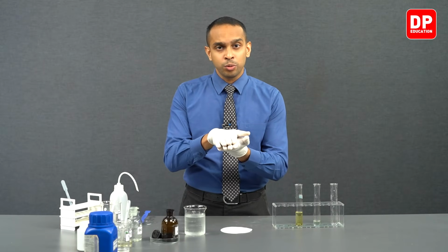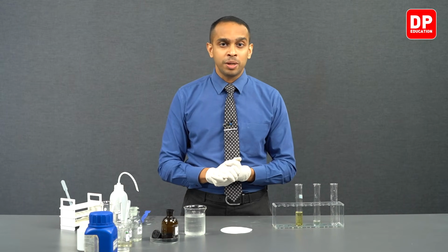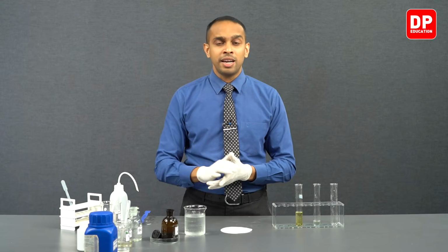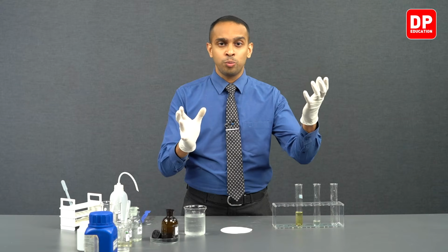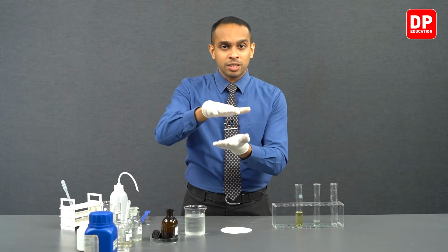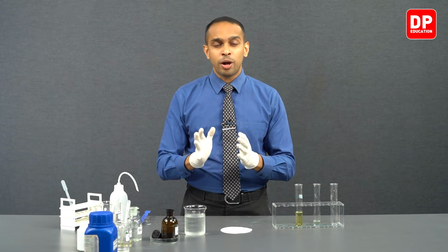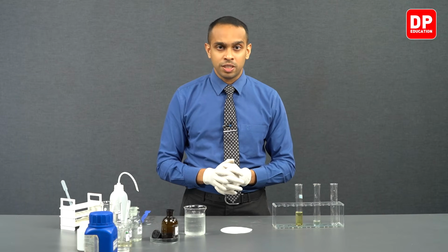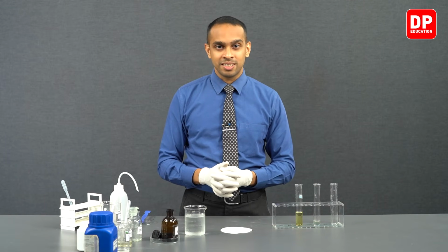At the place where the two layers meet, we saw Fe2+ convert into Fe3+, while nitrate ions turn into nitric oxide. This nitric oxide and the excess Fe2+ present in the medium, along with water, form a complex that is brown in color. That is why we observed a brown layer where the two layers meet at the interface. So this is referred to as the brown ring test, which is a very specific test that can be done to identify the presence of nitrate ions.